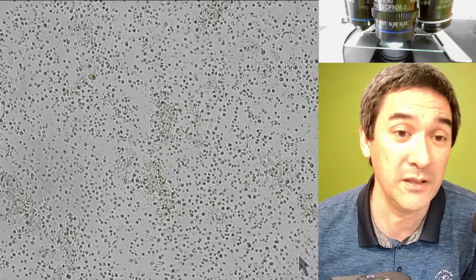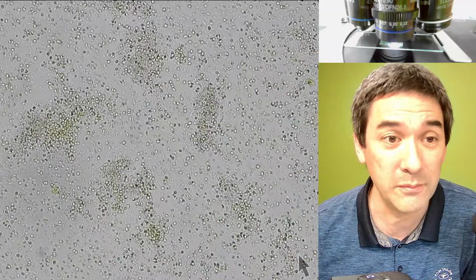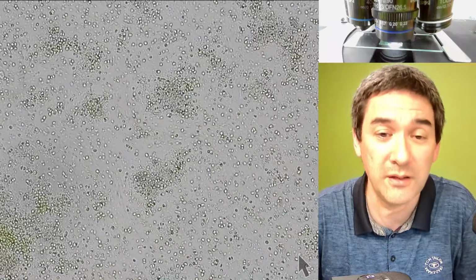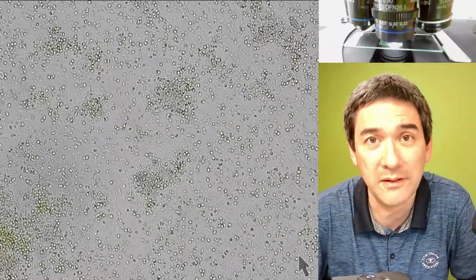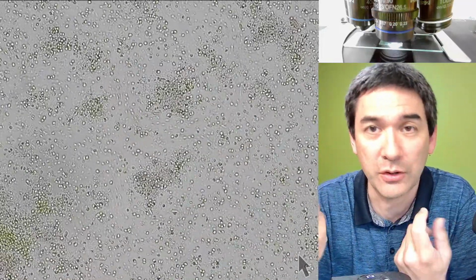Because you see, wow, I didn't know that there are actually so many cells in there, and they're quite much smaller than what I expected. Occasionally I see some ciliates moving around, right? Yeah. So we still learn something. So I'm trying to move the interest and the excitement away from these cool visual things to the actual learning, maybe.